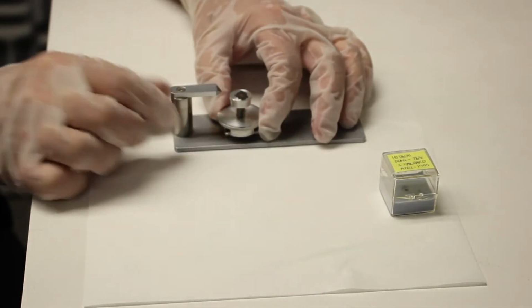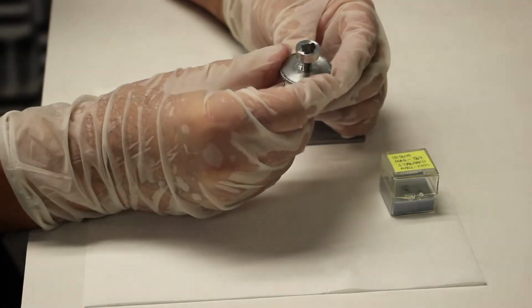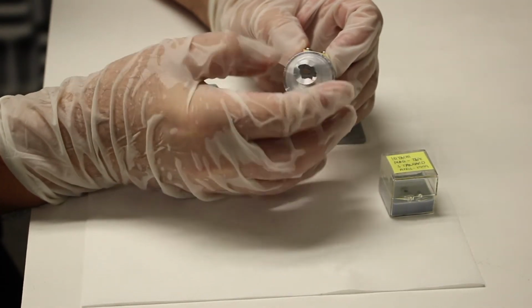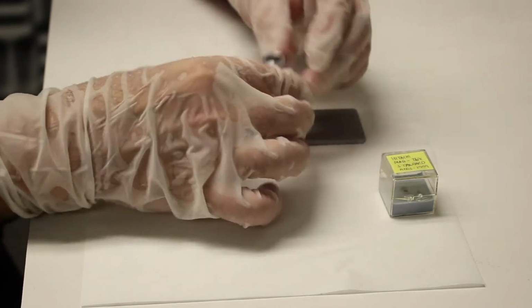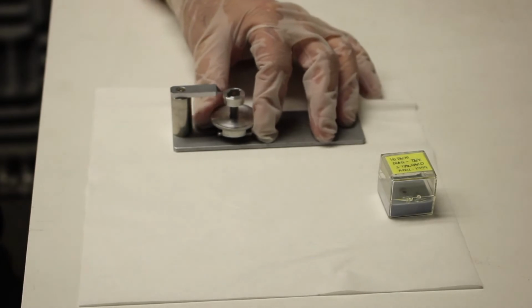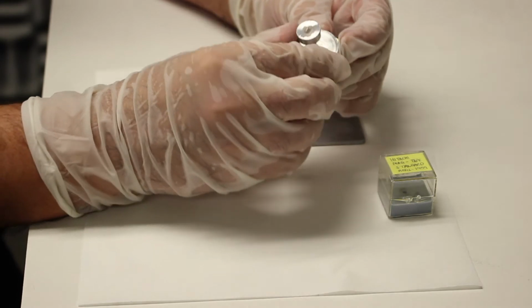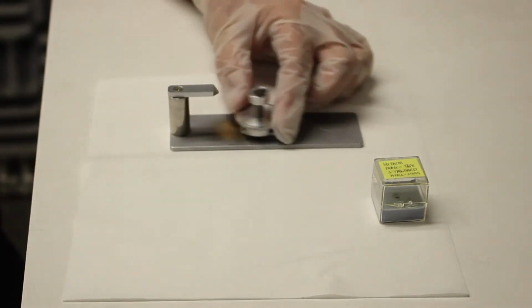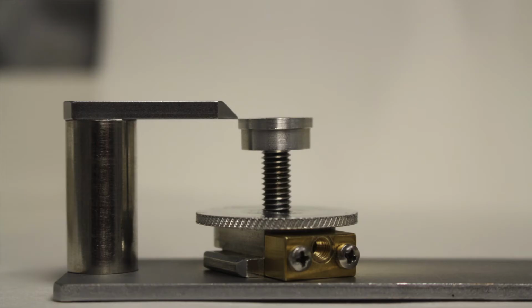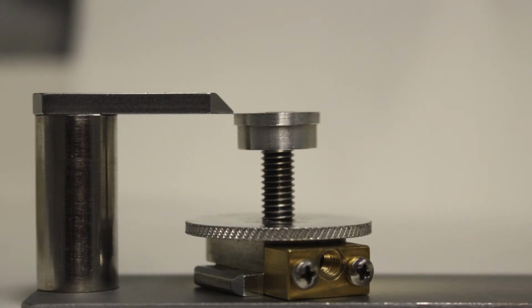Now we can check the height on the jig, and we see it's low. So unlock the washer a little and then just unwind the sample. Tighten it a little. Check the height. Just needs a little more. And that's about there. This will ensure that the sample, when loaded in the microscope, will be at the 12mm working distance, which is the default.